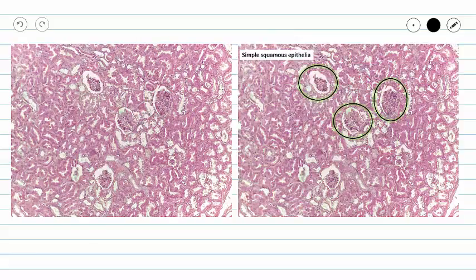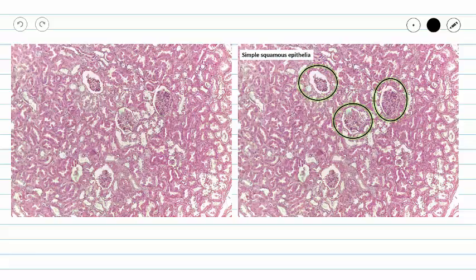And so we're not going to look at that today, but we are going to look at everything else. Everything else we see in this slide is going to make up other kidney tubules, not just the glomerular capsule, but other parts of our nephron. And as you can see, these tubules are going to line all the other internal spaces within our nephron.